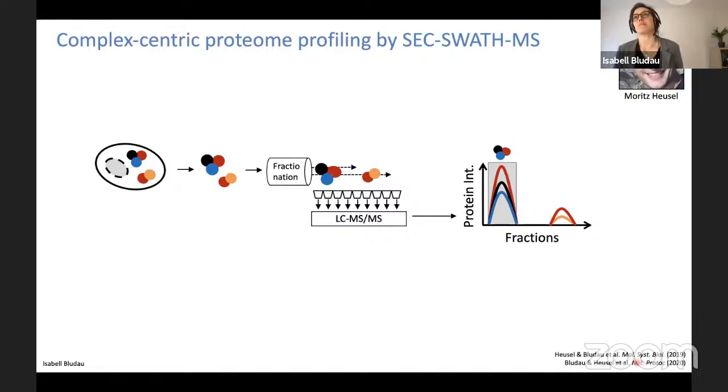In a typical experiment, we would find around maybe 400 complexes, and they are not completely homogeneously spread throughout the separation dimension. On average, I actually have to look it up. Maybe it was around 10 complexes or so, but might be a bit more.